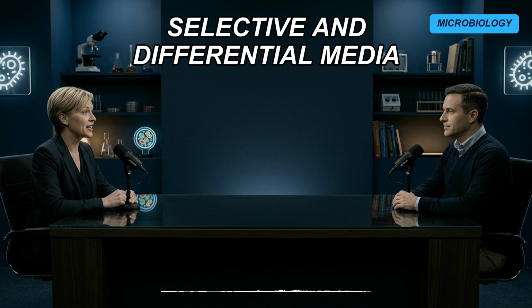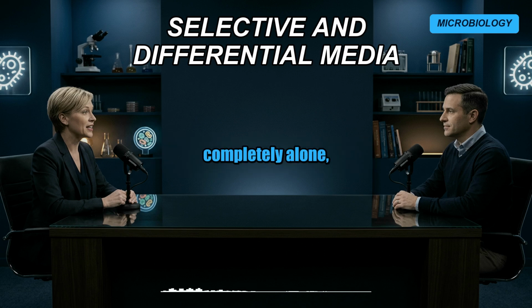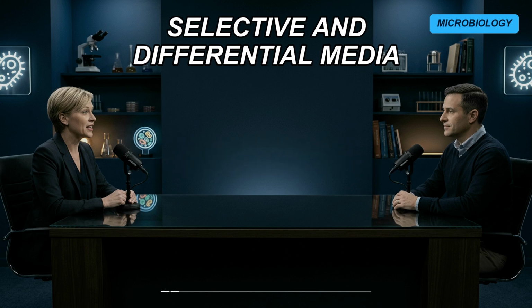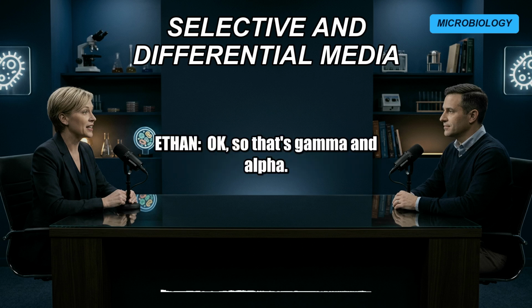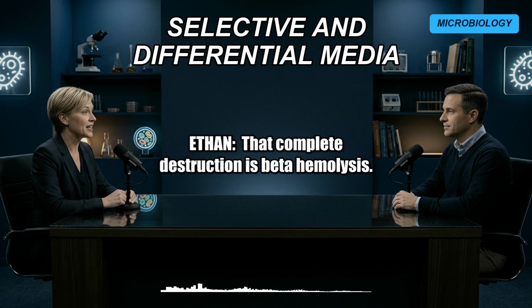Right. J.H. Brown identified 3 distinct patterns of destruction. Some bacteria grow on the surface and leave the blood completely alone, a pattern called gamma hemolysis. Others secrete chemicals that partially degrade the hemoglobin, leaving a bruised, murky, greenish zone around the colony, known as alpha hemolysis. Okay, so that's gamma and alpha. But the truly aggressive pathogens produce powerful toxins that completely rupture and shatter the red blood cells. That complete destruction is beta hemolysis.